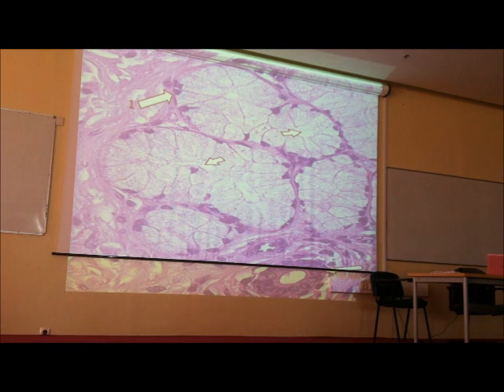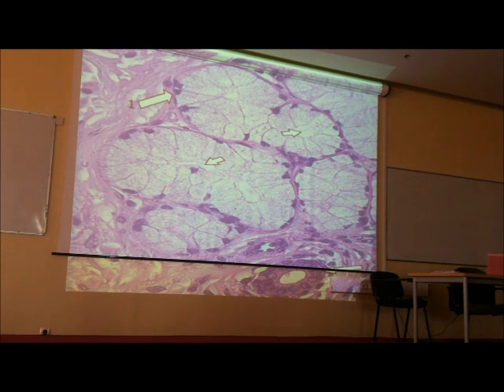Okay, what is about this slide? Mucus acinus. I may ask you, it's mucus acinus, type of secretion, and you have to select one of them. Site of nuclei, shape of nuclei, where you can find these mucus glands? In salivary glands, in trachea, yes, but mixed with serous.